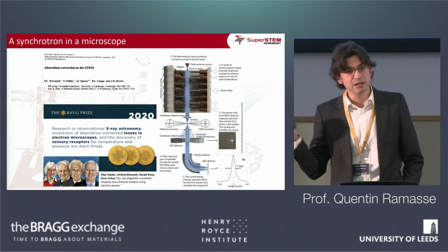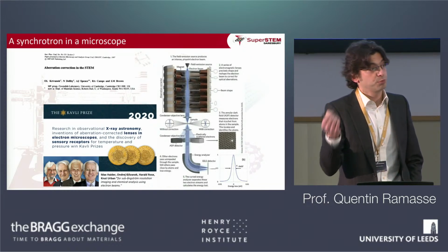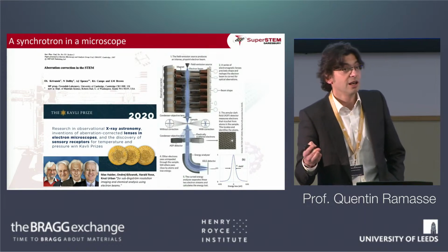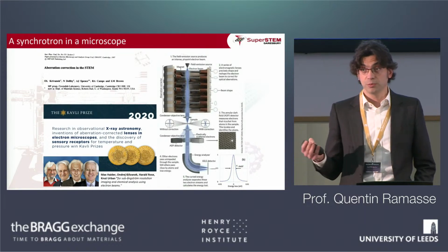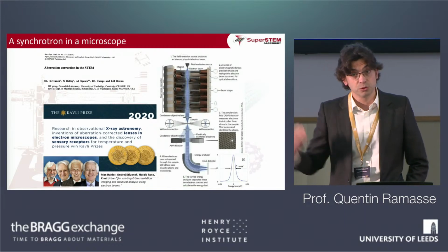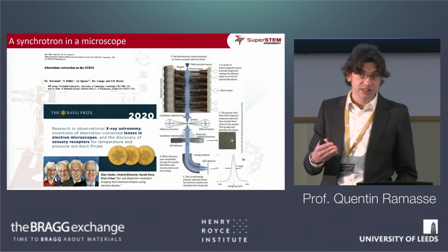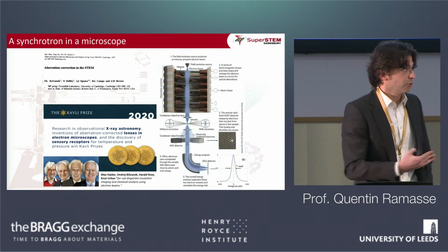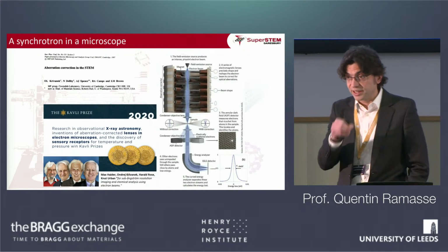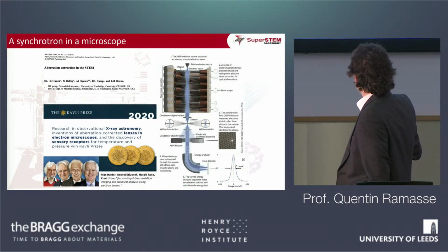So back in the day, 20 or so, or 40 years ago, the only way to get to atomic-sized probes with an electron microscope was to go to really high acceleration voltages, and that was potentially very damaging to materials, in particular those beam-sensitive materials, whereas now you're able to do this with much lower acceleration voltages, down into the 60 or 30 kilo electron volt regime, even lower than that, regimes that you would normally associate with a simple SEM.